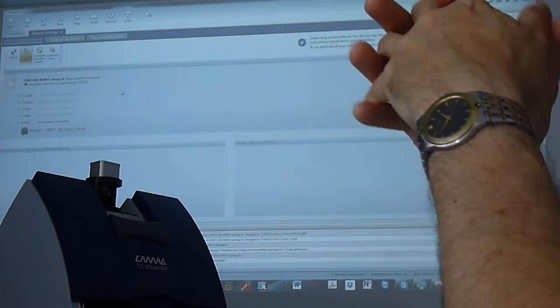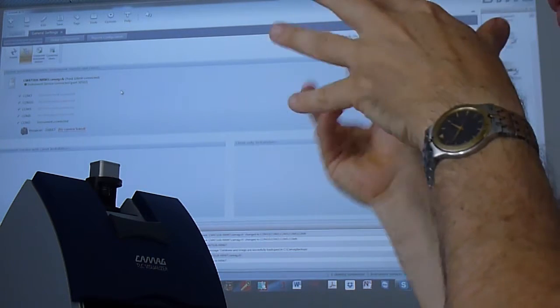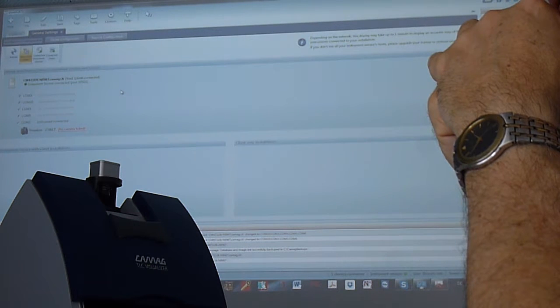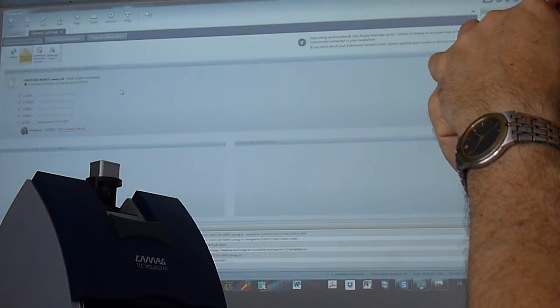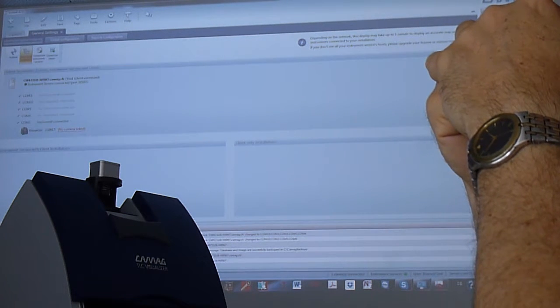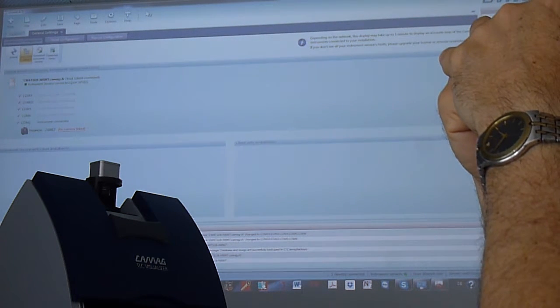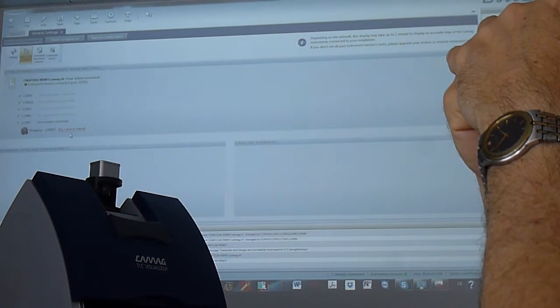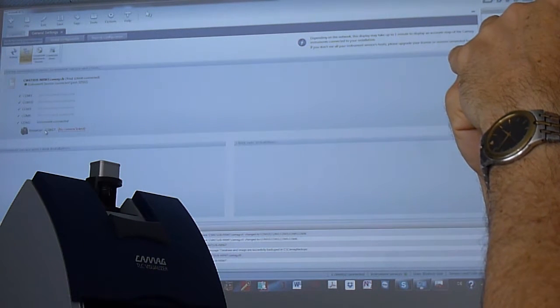So what could have been also is that if there is an error, not only Vision Cats is seeing that, it's showing us also Windows is. But I still have a problem. I don't see the camera, or the instrument is not connected. The thing is, it is shown no camera linked.